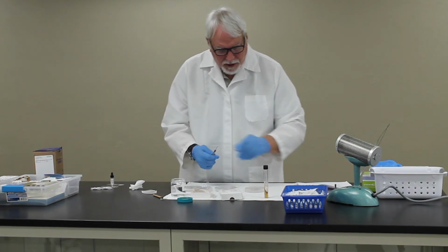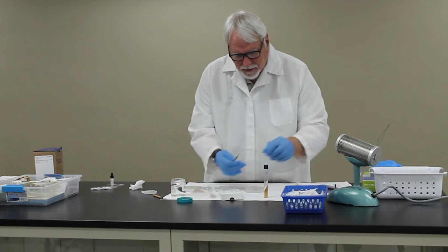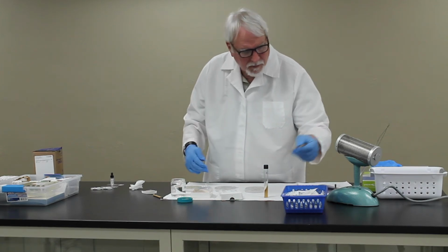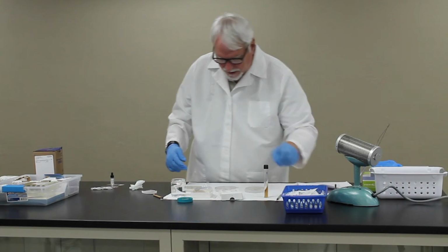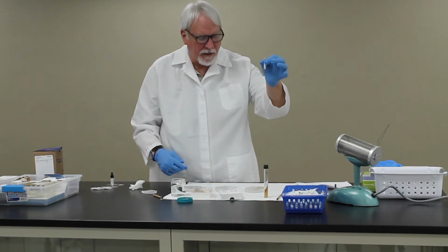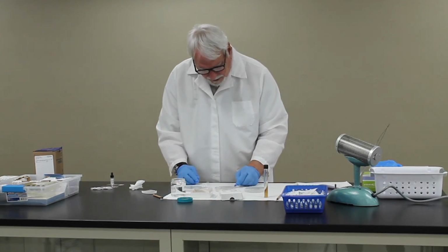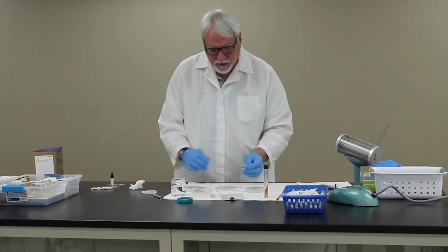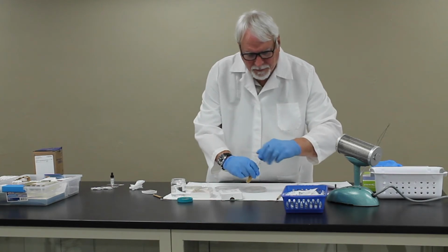Your next step is going to be to take another portion of that colony and flame that off just a little bit to sterilize it. Then we're going to take some cotton blue, our lactophenol cotton blue stain, place that on a slide, just a drop of it, and we'll give you a close-up of this in just a moment so you'll see exactly what we're doing.